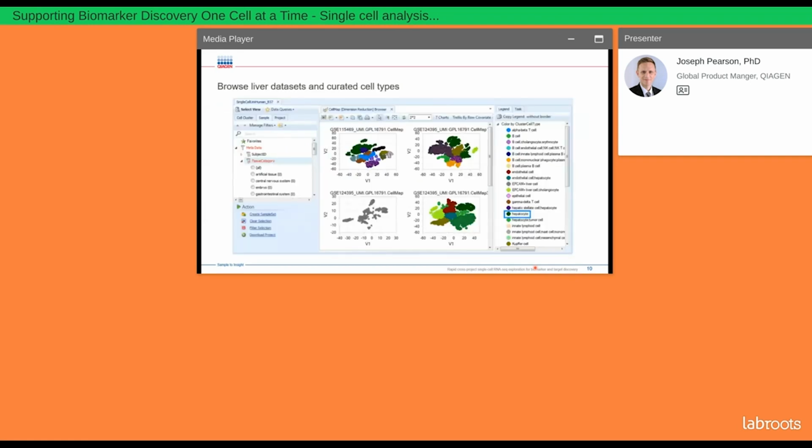Within the platform, let's say that you're interested in liver data sets. You can start with our filters on the left-hand side and filter down on any of the curated metadata. For example, the tissue category, filtering down only for samples that are from the liver. Here we can see multiple data sets from liver from multiple projects identified from the GSE number.